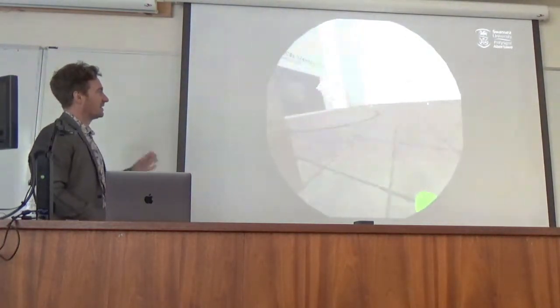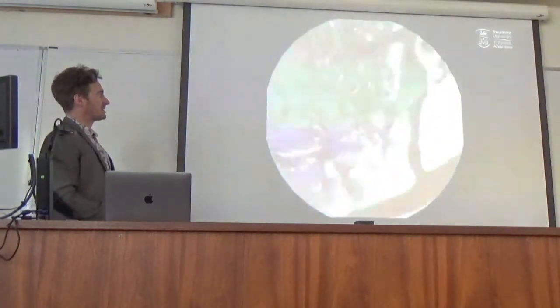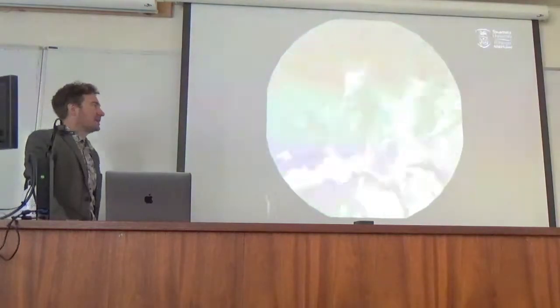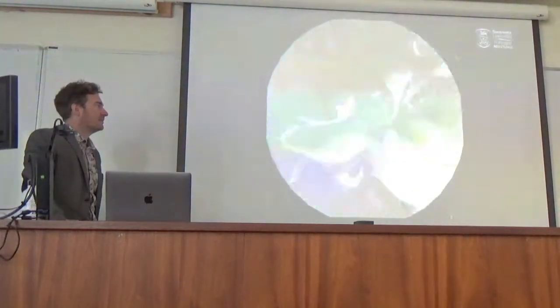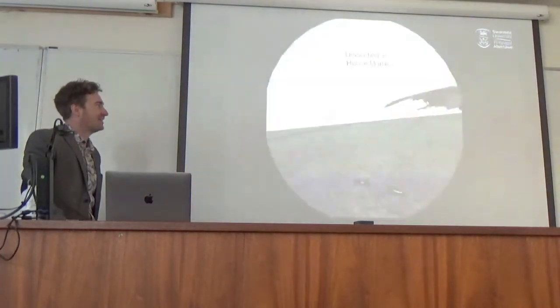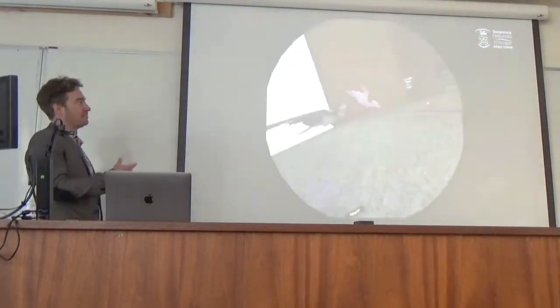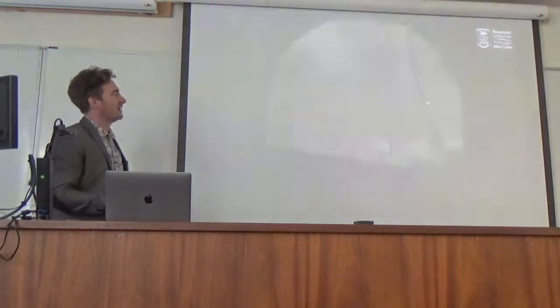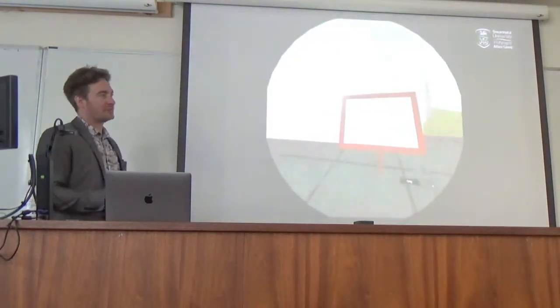Oh yeah, and this is early research, some of these things. There's a mouse knee, and then we can put our head inside that mouse knee and look at the trabeculae, because people might never have done that before. Very rarely people have. Over here then we have three different data sets. It's bone, skin, and feathers for a house martin, and the feather model is based on photogrammetry data.